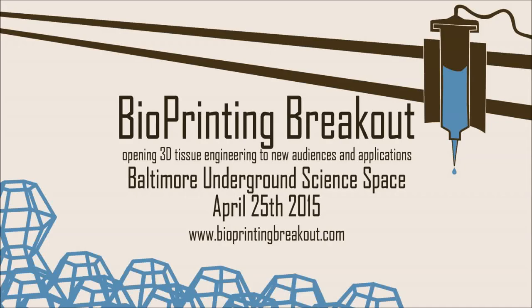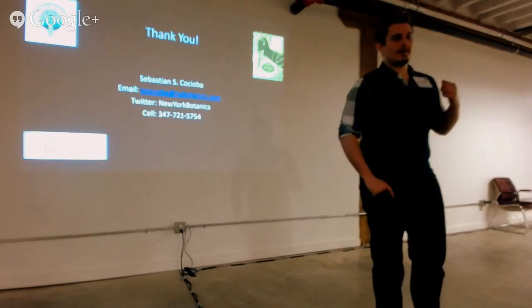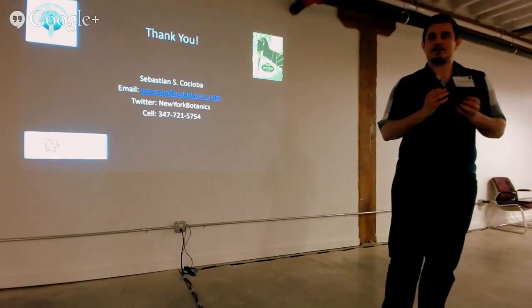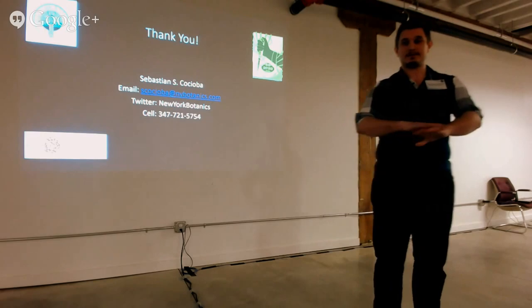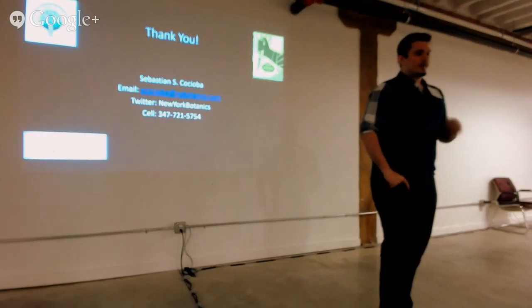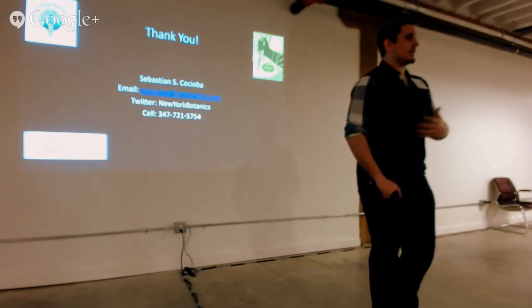It's like they're protecting themselves. Because tissue culture is a very rudimentary process, and a lot of people suffer with contamination issues. My contamination rate, not to brag, is like 1 in 500, 1 in 600 jars. A lot of the time that happens with endogenous fungi that you just can't control, because it pops out at a later point and all of a sudden your plate is contaminated. So anybody starting with tissue culture always faces contamination, and that leads to a lot of grief, and then you just don't want to do it anymore.